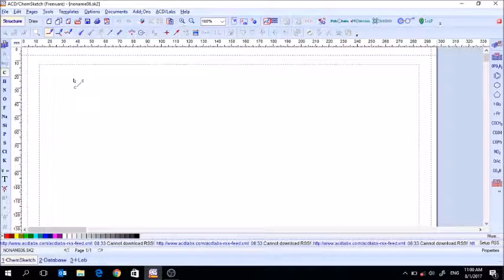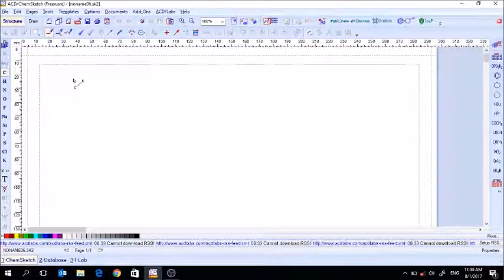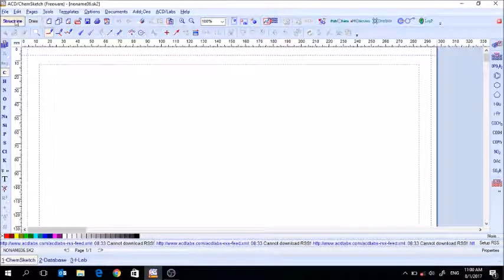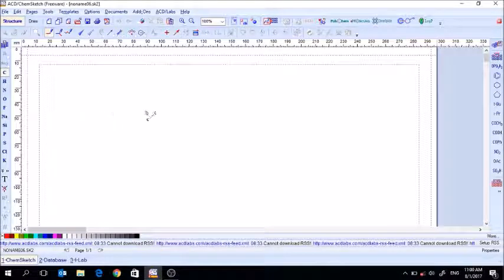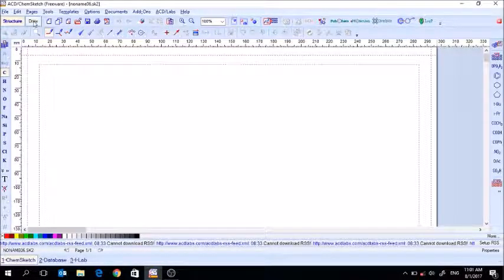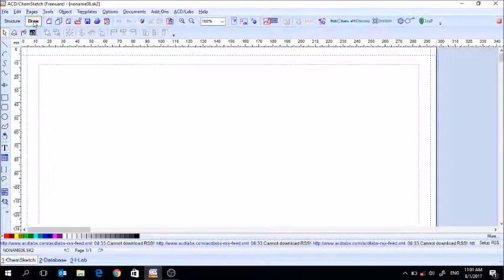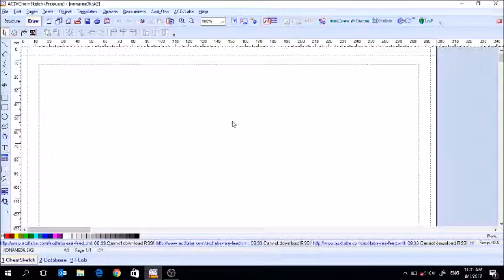There are two drawing modes in ChemSketch. The first one, at the top left, is structure mode, and then you have draw mode. Structure mode is just like it sounds — it's the one you use to draw your chemical structures. Draw mode is the mode you use to add graphics and other things to your drawing.